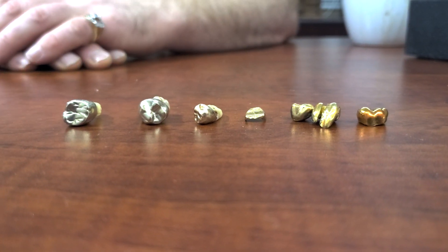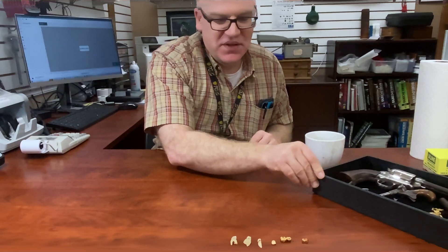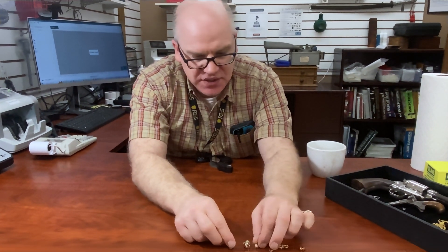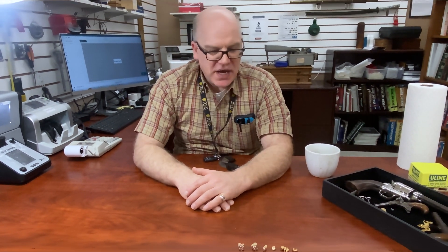We have several different types of gold teeth to go over and I'll show you how we test to see if they're gold. You can see these molars — I left the root in because it's so disgusting — just to show how big your tooth root is. From the color of these there's a slightly different hue. My dentist told me that traditional dental gold, which is 16 carat, wears at the same rate as tooth enamel — one of the main reasons they used gold as fillings for many years.